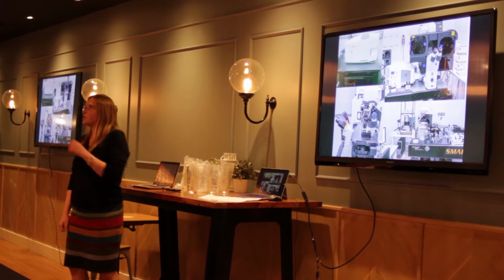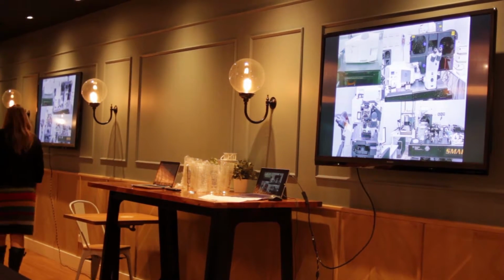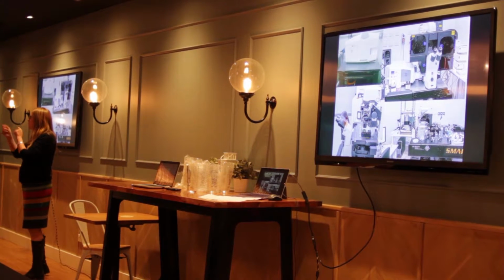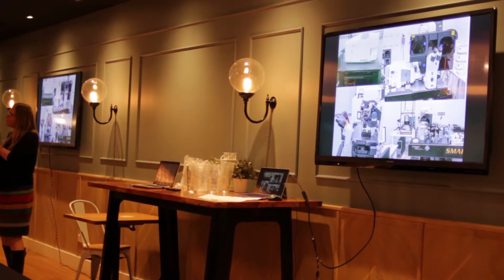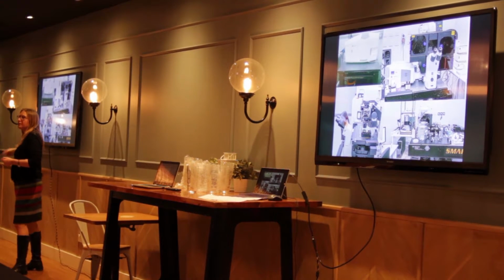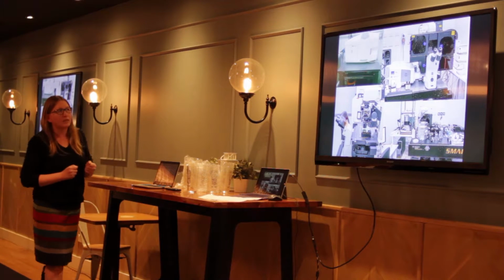this is what some of these microscopes look like. They don't really look like microscopes very much anymore. This one does. This one's a single molecule microscope. You can actually see single molecules moving around them, watching them bind to DNA, watch RNA polymerase bind to DNA and measure the kinetics. Live cell imaging. Okay? You keep the temperature and the humidity and everything just right, and we keep cancer cells or cells alive for a really long time when we test drugs and do those sorts of things.